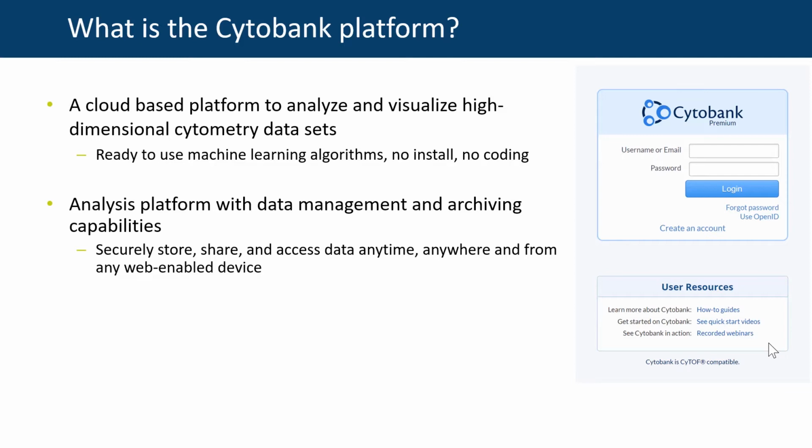And the great part about being a web-based software, especially right now in the current situation we're in, where we're all having to adjust to a new normal of working from home or working very briefly in the lab, is that everything's going to be centrally located on the cloud. So all of the data that's been uploaded will be available on the cloud, and all of the analysis that has been completed thus far will be uploaded onto the cloud.